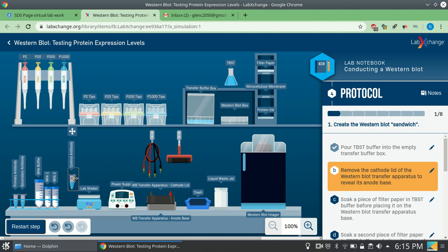Right? So the control antibody is specific not to CCR5 because CCR5 is the purpose of this experiment. The control antibody is specific to a protein that is in every cell. In this case, this control antibody is specific to tubulin, which I think is like a cytoskeleton structural protein. But it's a protein that we're not touching with these edits. So all the cells should have this protein. So one more time, the reason why we're using this control antibody is to verify that our process of Western blotting works.